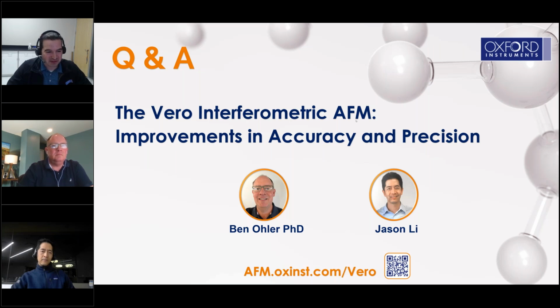Here's a question for Ben: is it possible to upgrade an existing Cypher to use QPDI? Yes, absolutely. Most Cyphers can be upgraded. We can convert them over to Vero. The exceptions are some very old Cyphers, but the vast majority can be upgraded to Vero. It's fairly extensive, of course, because we have to replace the whole cantilever detection optics. Basically, what we call the head needs to be completely swapped out. Some of the electronics need to be upgraded, including the controller. Vero requires our new ARC3 controller. Any system that doesn't have that, which would be most of the Cyphers out in the field, would also need a controller upgrade. But it's certainly possible. If you're interested, please contact us and we can let you know what it would take to do it.